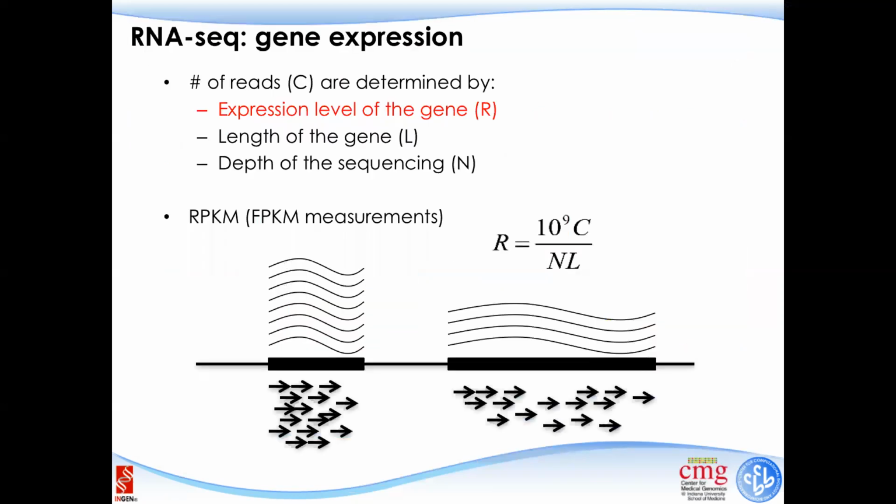And then we talked about gene expression quantification. Once we get the counts aligned to the genome, we can count the number of reads mapped to each gene. But these counts are still not the relative gene expression abundance, because across different samples the counts are biased by the total number of counts in each sample, and among different genes they are biased by the length of genes. So we introduced the idea of RPKM, and also the same one, FPKM, for paired-end data.